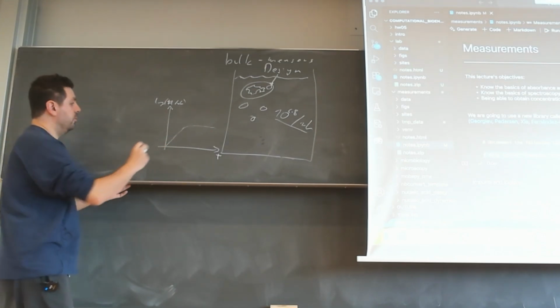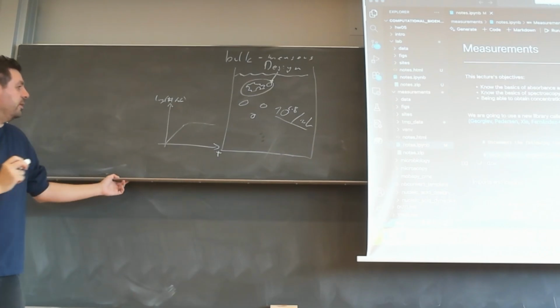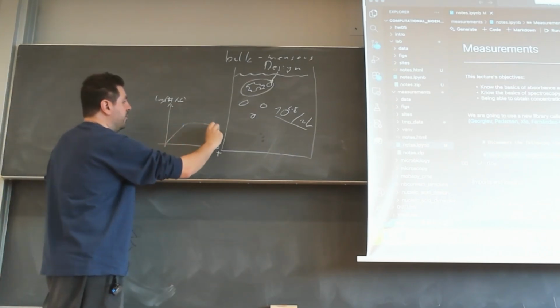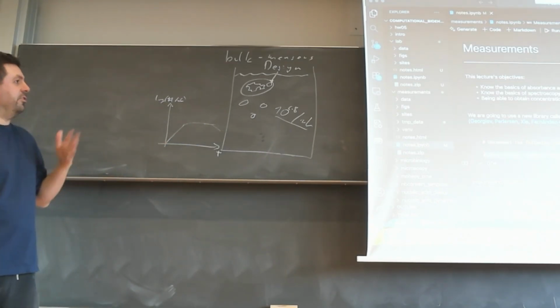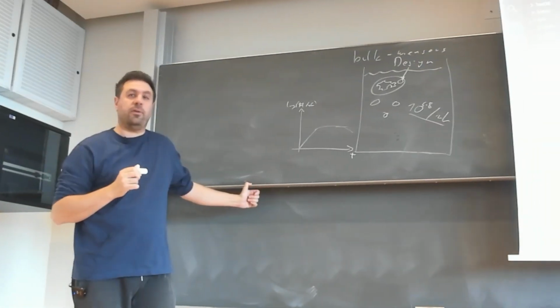You will read off, for example, the inclination, the growth rate here, or you will know when it goes to stationary phase, when perhaps it even goes down. You can couple this with fluorescence measurements, and so on and so on. So there's lots of information in these plots.